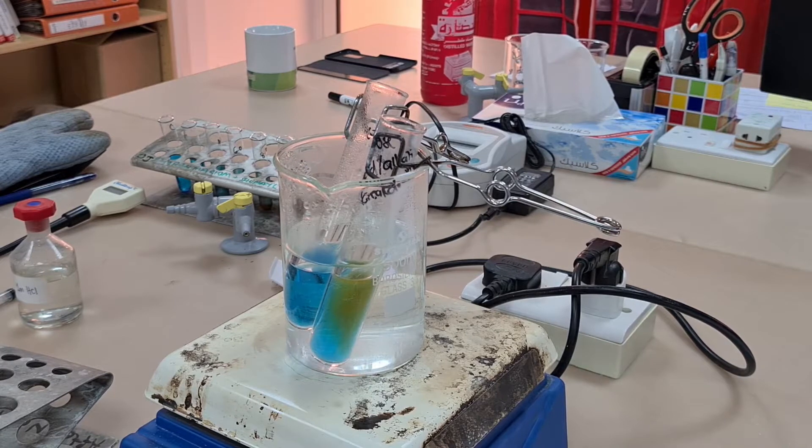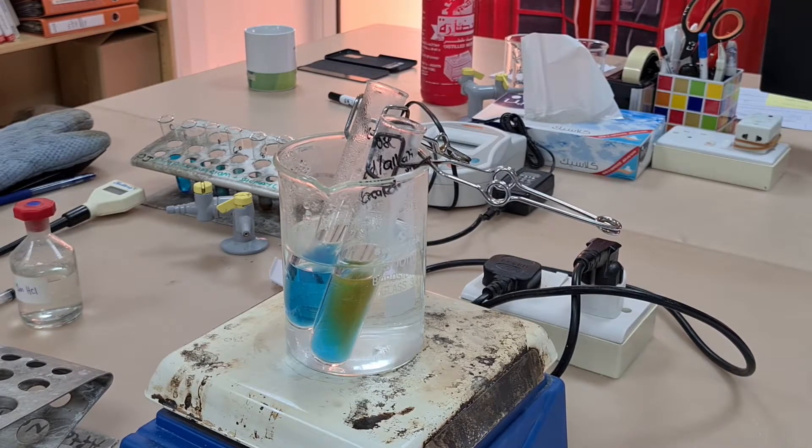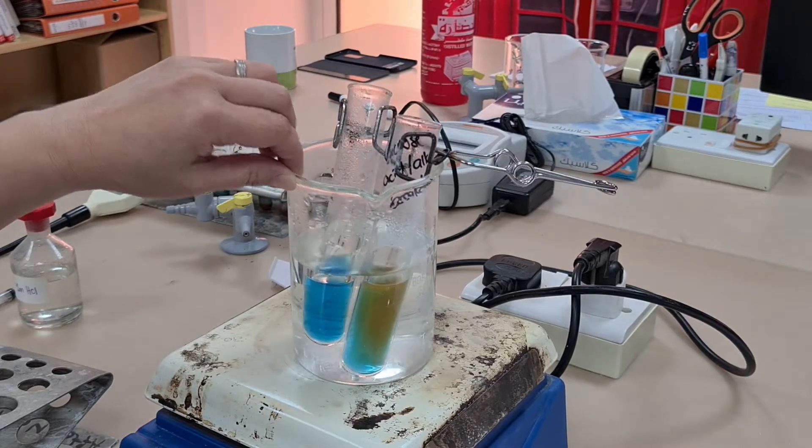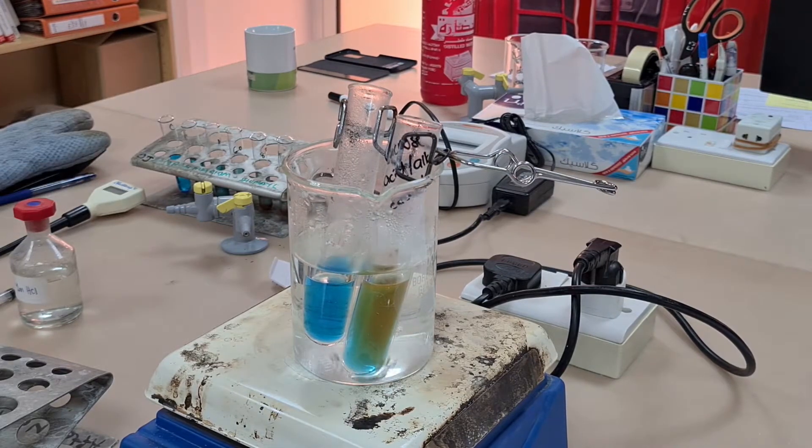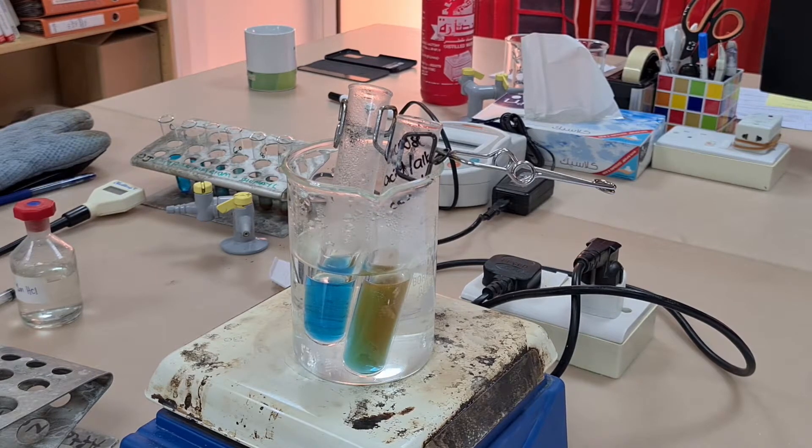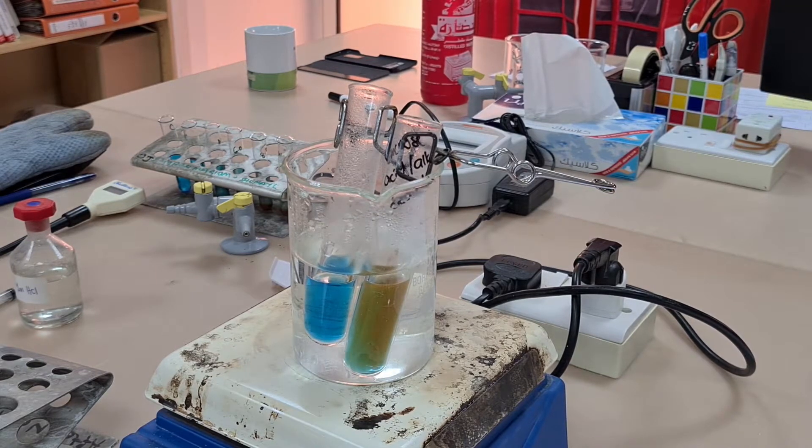A couple of minutes into the experiment and you can see already that we're starting to have a color change. Remember, this is qualitative Benedict's reagent. It tells you whether the solution contains reducing sugars or not.